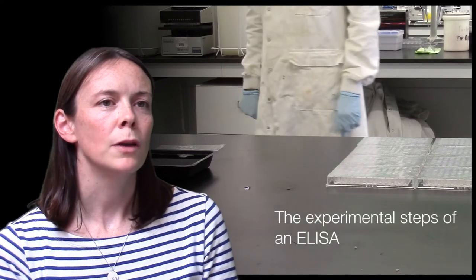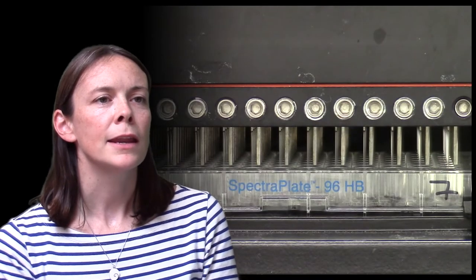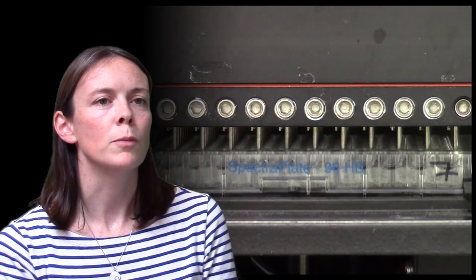ELISA plates were coated overnight with an excess of the HIV envelope protein that was used in the vaccine and then any unbound protein is washed off using a robot.